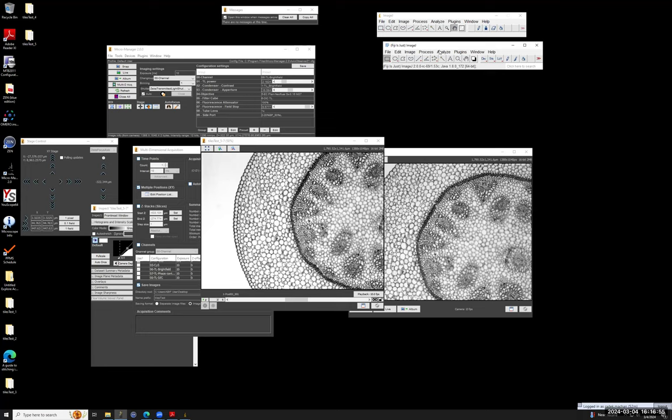So I don't want to create here the impression that the macro that I will be now running does the stitching. That's not true, because the stitching, that's the difficult, the non-trivial part. And the stitching is done by Stephan Preibisch's plugin. But what the macro does is just to simplify calling this plugin, so that we don't need to take care of, let's say, the names of the files. So we can use them how they come out from Micromanager. So I will show you.